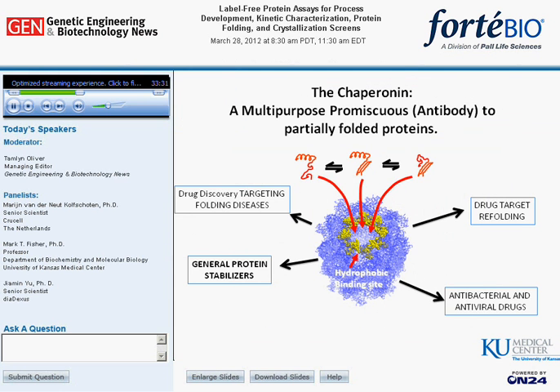The examples presented are just a small sampling of the wide variety of protein systems that we now can use to identify protein stabilizers using our highly pure chaperonin system under near physiological conditions. In our laboratory alone, we have documented over 50 proteins that interact with the chaperonin as partially folded proteins. 11 of these proteins are classified as authentic folding disease proteins. In all cases, we can readily observe chaperonin binding to these moving targets, and now with the Octet system or BLItz system, we can rapidly interrogate folding integrity of any protein that exposes a hydrophobic surface to solvent, even if this occurs transiently.